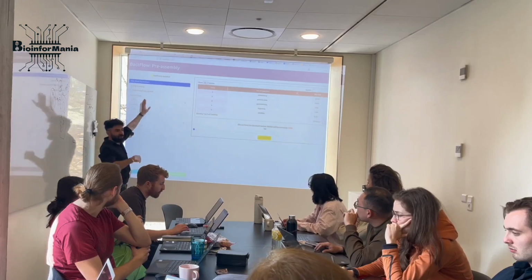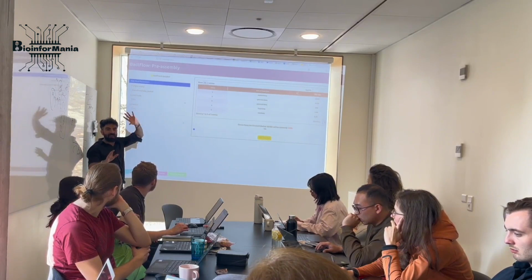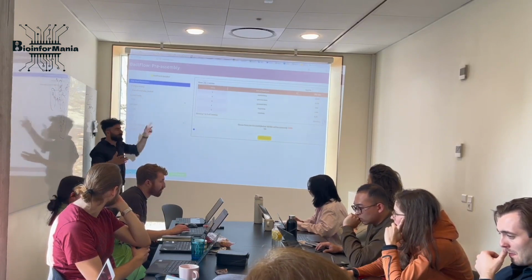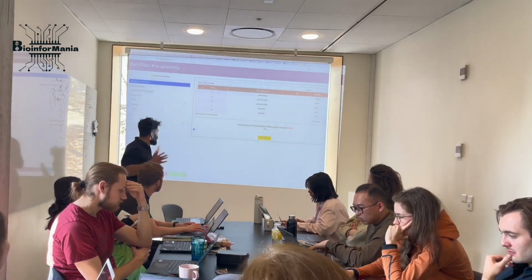So it exposes anything inside that folder. Anything inside that folder will be available. So this is going to be our working directory. Good, good. Now we are there.